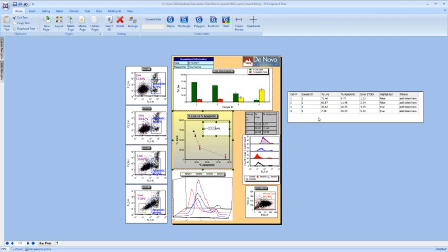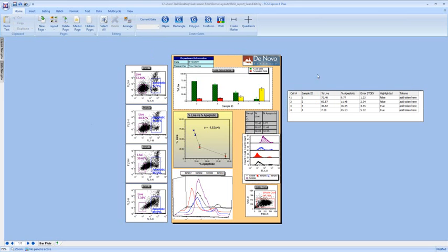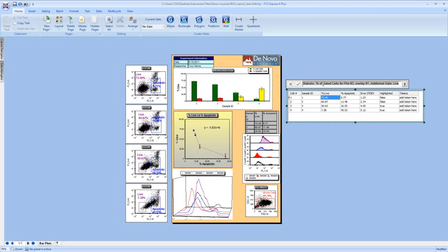I also want to point out that these values in the custom data grid don't have to be tokens that live update. If you want, you can see here for the sample ID, which is just another parameter that we could put in, you can just manually enter numbers in this custom data grid. So if you choose not to do tokens, that's fine. I highly suggest that you do use tokens, since you're going to get the most out of the software that way.